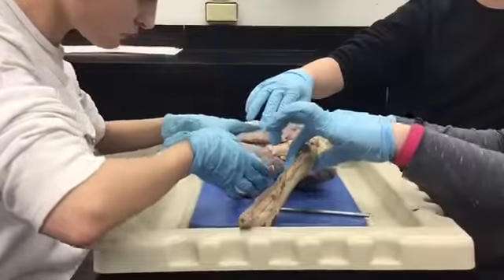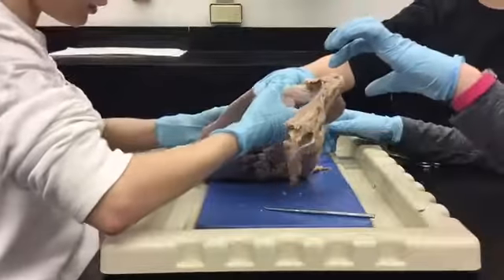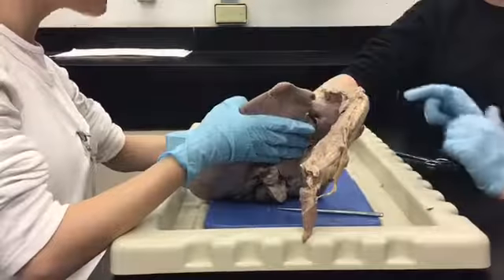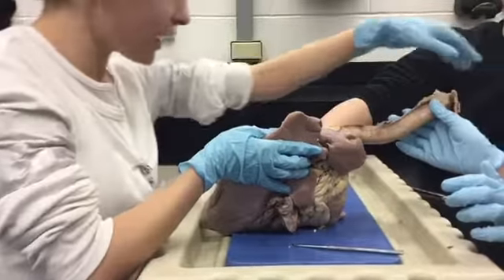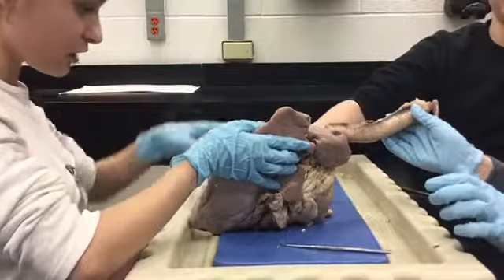But the heart is right here. So this is the right, because it has three lobes. This is the right, and that's the left. It goes like this. Right here's the head. Right here's the tail. And on this side is the left.